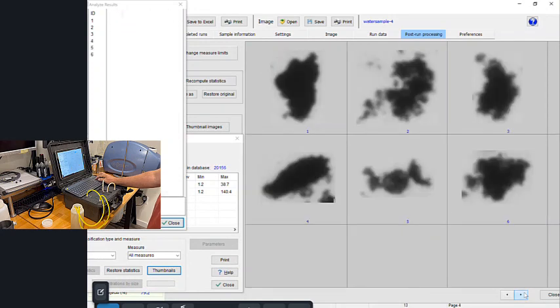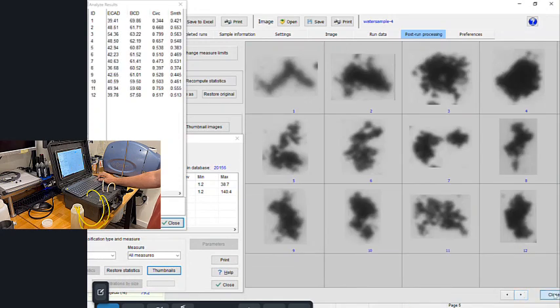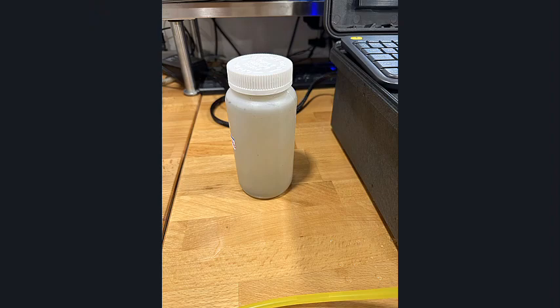There are several other tools available that come with dynamic image analysis where you can look at different things such as scatter plots. You can actually compare one sample to the next. In the case of the wastewater, if we have several different samples from different times, we can actually monitor the contamination concentration of specific subpopulations over time from, let's say, one week to another, or 1 month to another, or one reservoir to another.